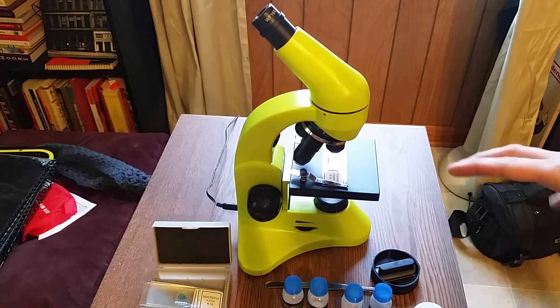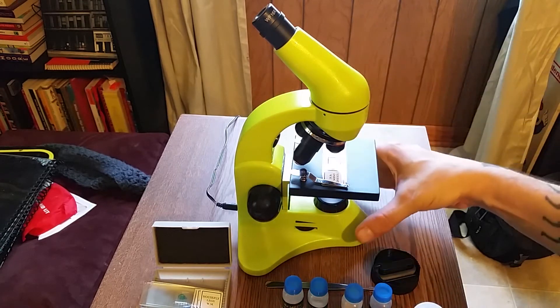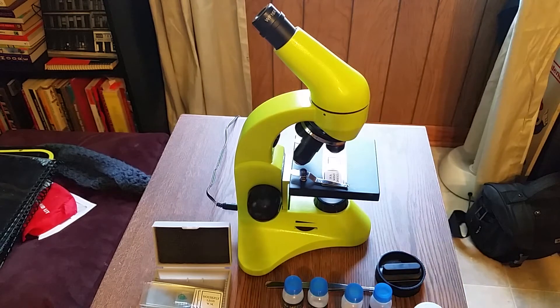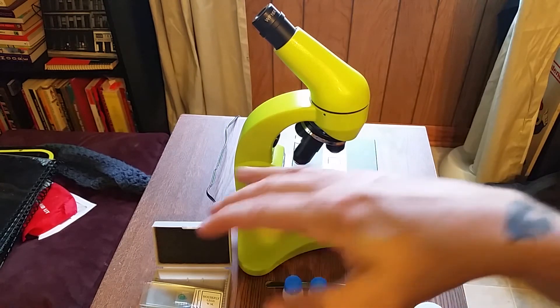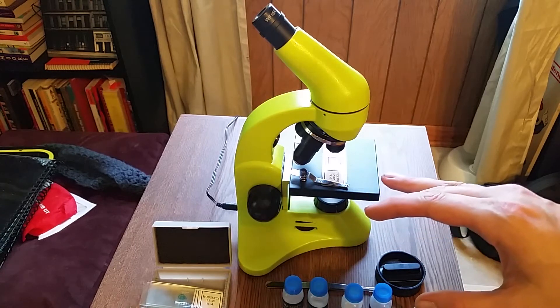Everything houses in a nice hard shell plastic case as well — I'll show you that at the very end. But first I wanted to show you everything about the microscope. This also includes a K50 experimental kit.